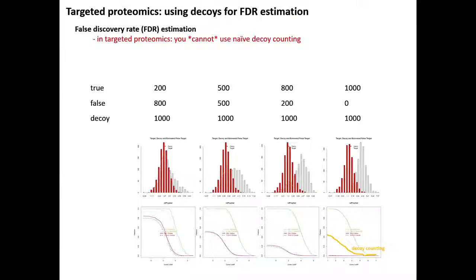I think Ben wrote a box in the library generation paper that we wrote. So the bad sequences that you mentioned are coming from your library. This would be a mistake from the DDA database search results, so you need to clean those in advance. There you need to apply stringent FDR on your DDA database search approaches, because if you have a wrong name on top of a spectrum, even if the spectrum is beautiful, you will identify it in your DIA data. But if the name is wrong, because the wrong name comes from the DDA approach, there's no way you can figure it out in DIA.